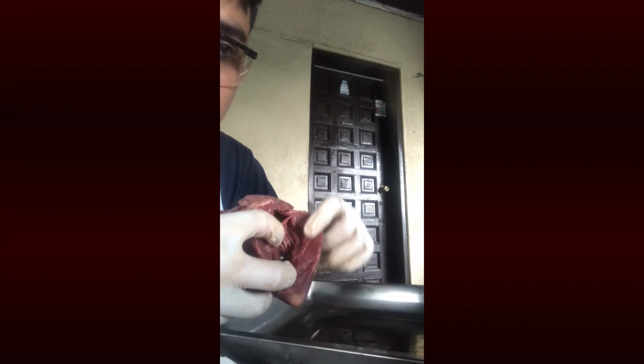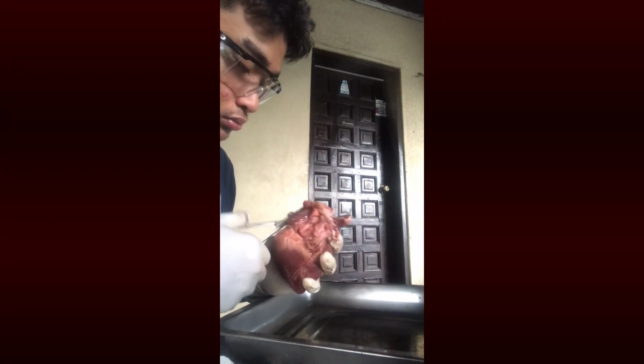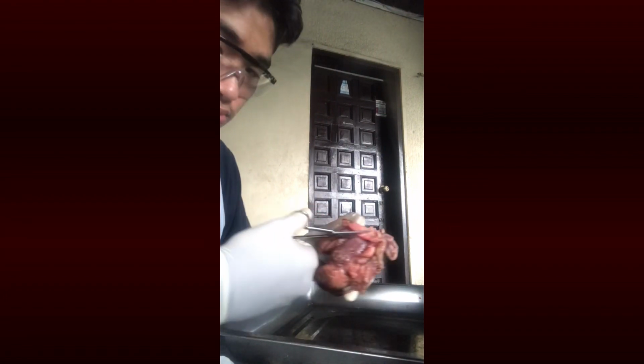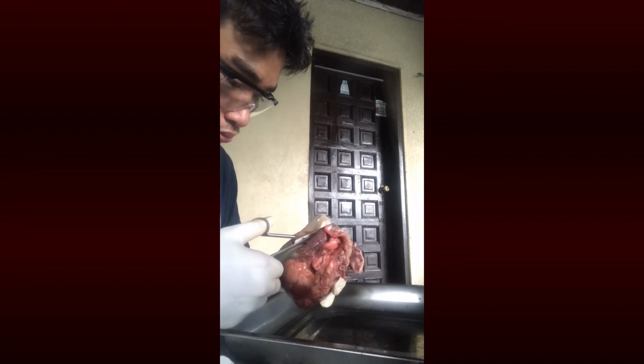Examine the left ventricle. Notice the thickness of the ventricular wall. Using your scissors, cut across the left ventricle toward the aorta and continue cutting to expose the valve.